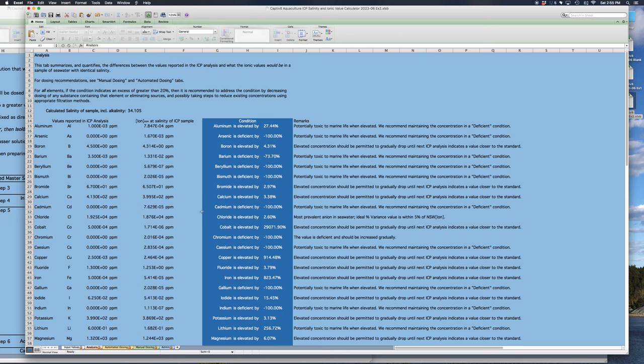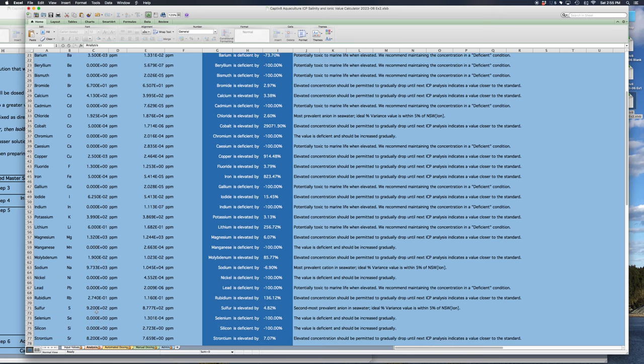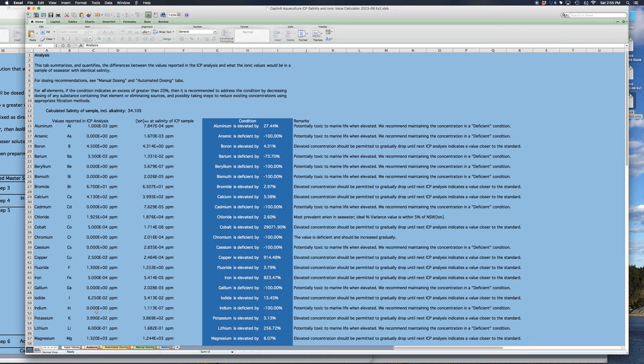it does tell you that at the salinity of your sample, calcium would be 399.5, but it's 413 in this instance. Magnesium, another great example. Your magnesium would be 1244, but the value that was entered here was 1320, and so on and so forth. So it just provides you with that piece of information. It's just there as informational.